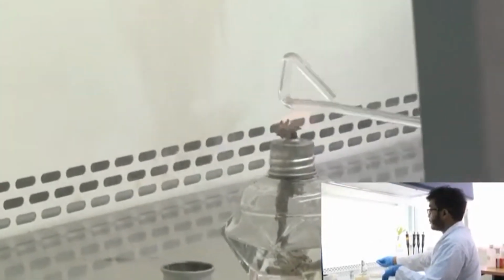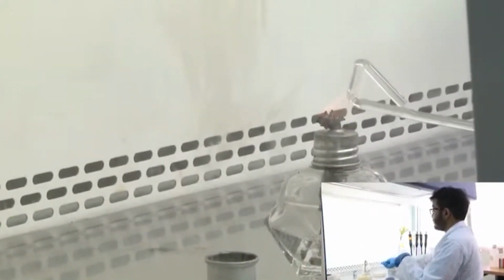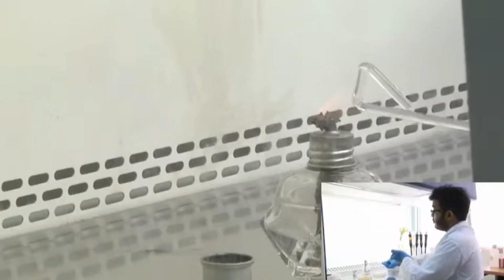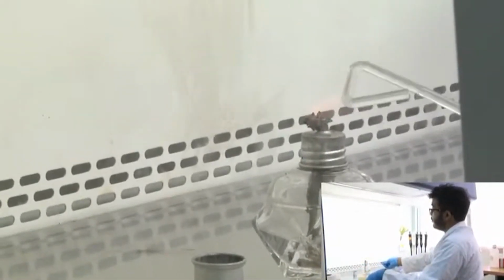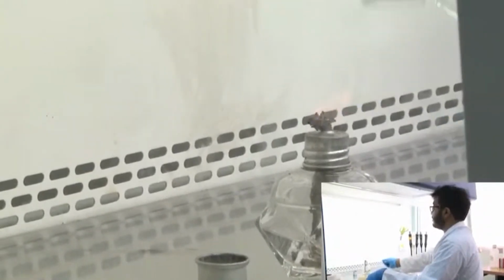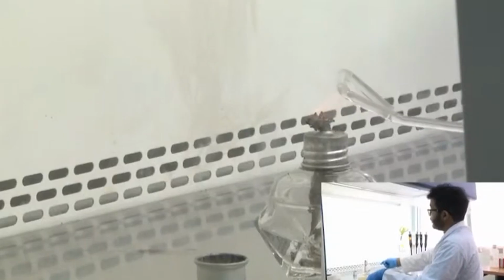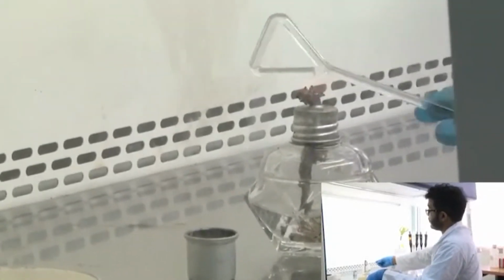Holding it to the flame ensures that the ethanol is removed, because as you know, 70% ethanol kills bacteria, right? It is for sterilization purposes. In case your spreader contains a residual amount of ethanol after you have sterilized it, and you spread your transformed bacteria with it, there is a very high chance that you are going to end up killing your bacteria then and there. Ethanol is volatile, so to remove it, we are just heating it up in the burner.